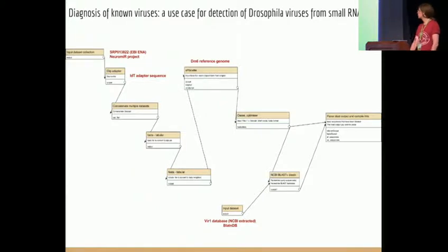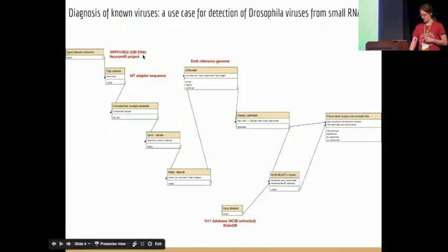So I'm going to show you one example, one of the examples that we have recently published in collaboration. This is the whole workflow. We're downloading sequencing datasets from the SRA. We do, as I said, the clipping; all the steps down here are relatively standard.